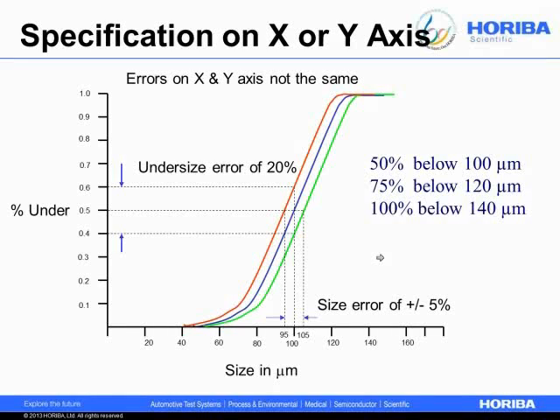All right, so let's talk a little bit about setting good size specifications. One of the more common issues we run into with people who've set size specifications is if they're speccing on the percent under the curve, let's say, that can be very different than setting the spec based on size.